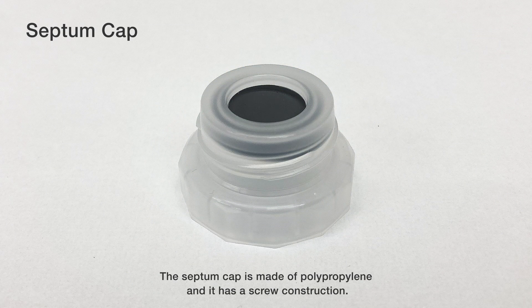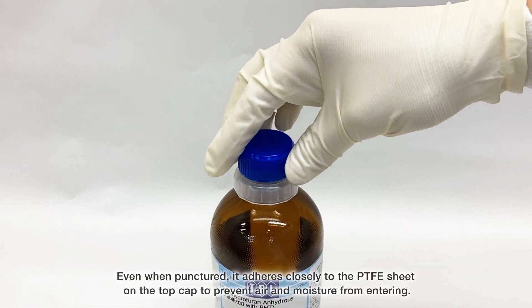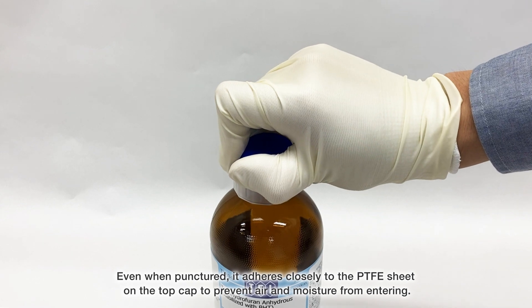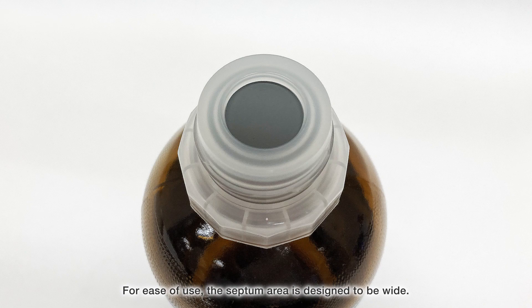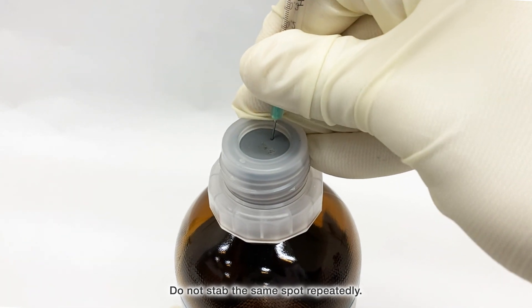The septum cap is made of polypropylene and has a screw construction. The septum part is made of rubber material with high sealing performance. Even when punctured, it adheres closely to the PTFE sheet on the top cap to prevent air and moisture from entering. For ease of use, the septum area is designed to be wide. Do not stab the same spot repeatedly.